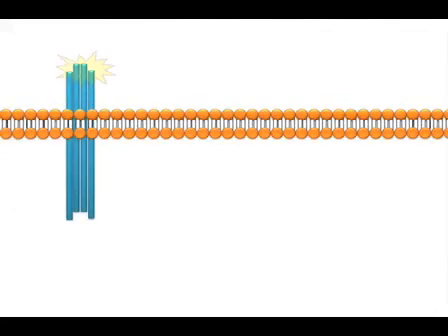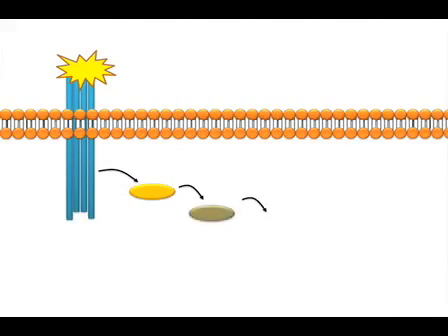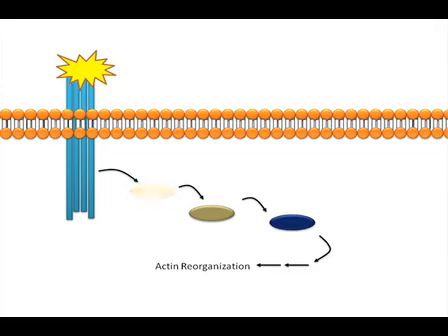Signal transduction is accomplished by a series of biochemical components that transmit information and elicit phenotypic changes, such as actin reorganization. Our protein of interest is RAC1, a small GTPase that is important in mediating actin dynamics including cell adhesion, migration, and morphology. In this investigation, we will use the Cre-LOXP system to remove this gene and confirm its role in the cell.